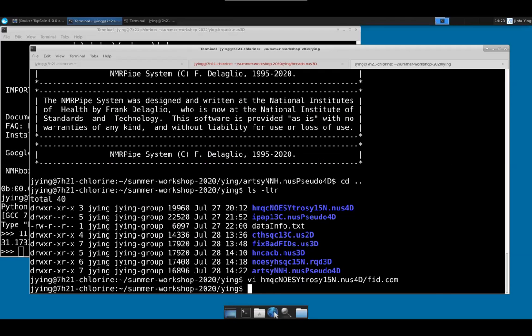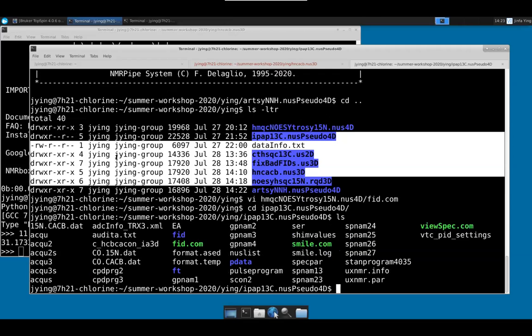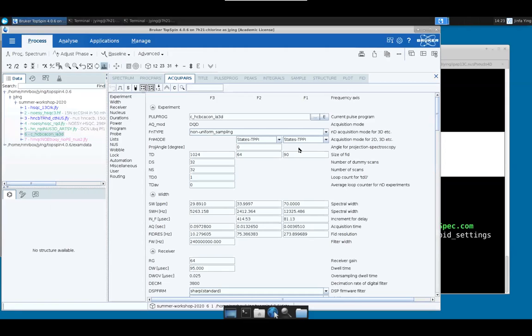Just allow me a few minutes to briefly talk to you about this IPAP C13 decoupled C13 detection experiment. If you come over here to my TopSpin and type EDA, you see there's something called AQ sequence in Bruker, and here it's 3, 2, 1.